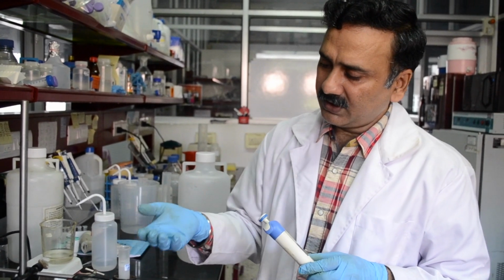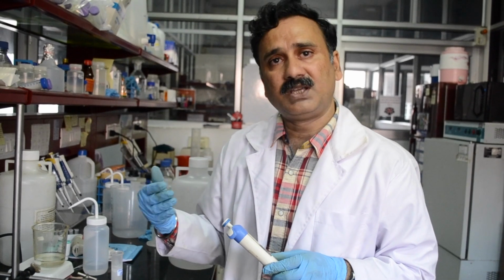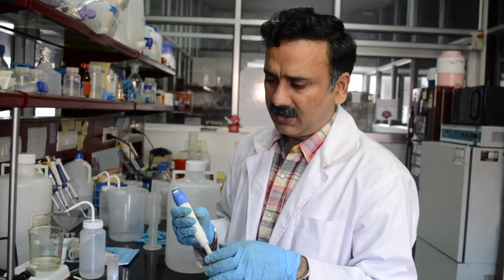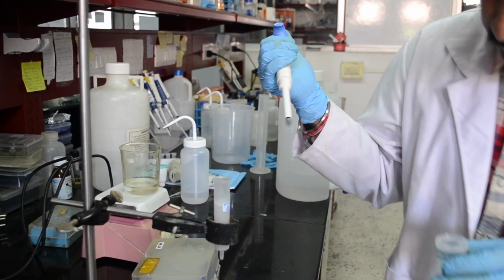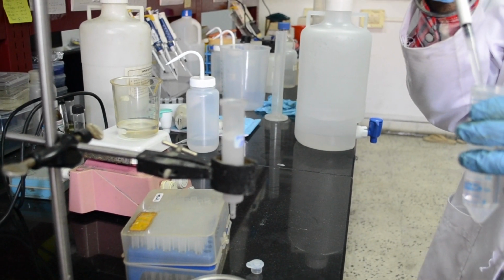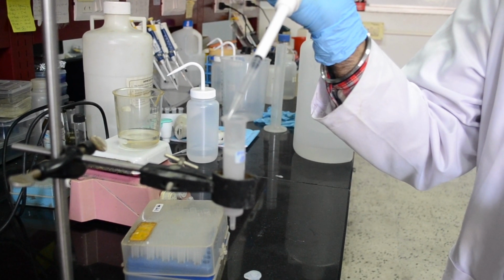If you are interested, you can also connect this column to a purification machine, but since this only takes 5 to 10 minutes, people normally don't prefer to connect the column to the purification system. What you see is that the buffer has now reached the disc, and now we can simply add the buffer or the water and fill it up to the top.